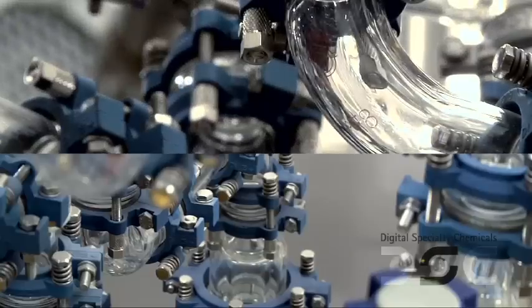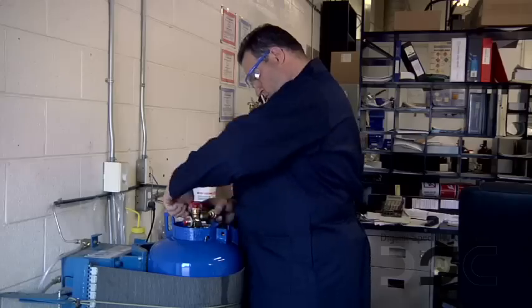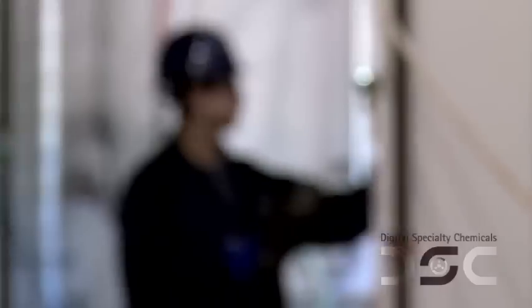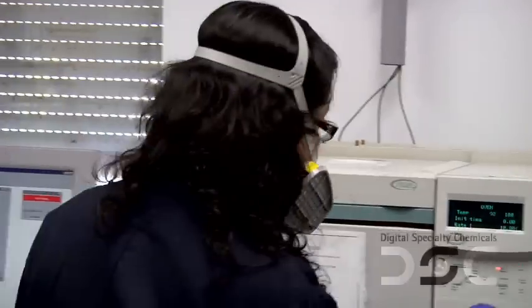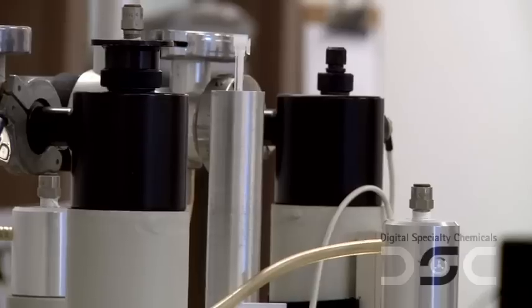A number of our products are highly air and moisture sensitive and therefore need to be handled correctly in order to prevent product decomposition and to obtain accurate analytical results using a range of instrumentation such as HPLC, GC, and NMR.